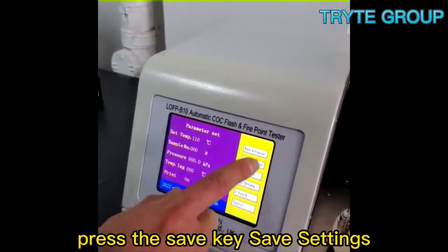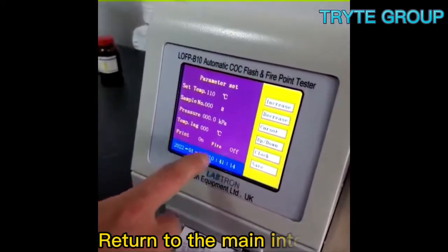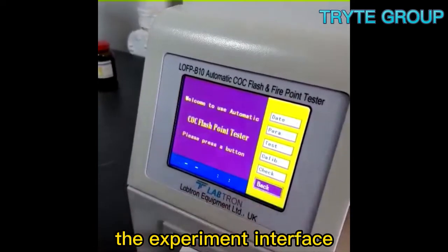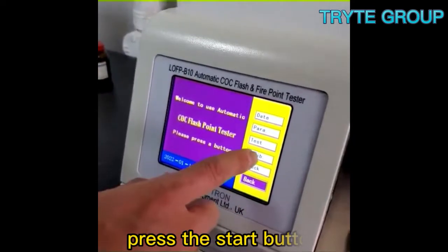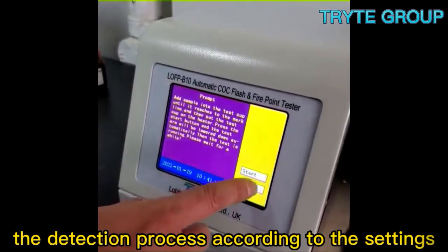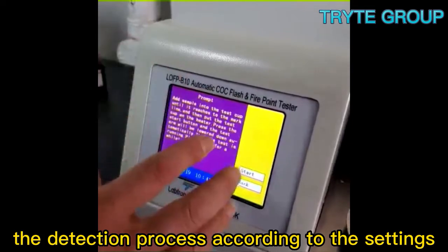After the setting is completed, press the save key to save the settings. Return to the main interface and click the third option to enter the experiment interface. Press the start button, and the instrument will automatically enter the detection process according to the settings.